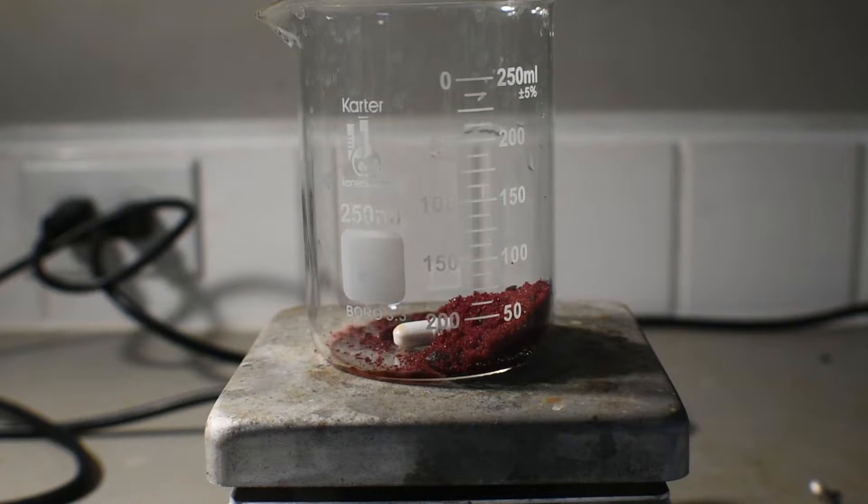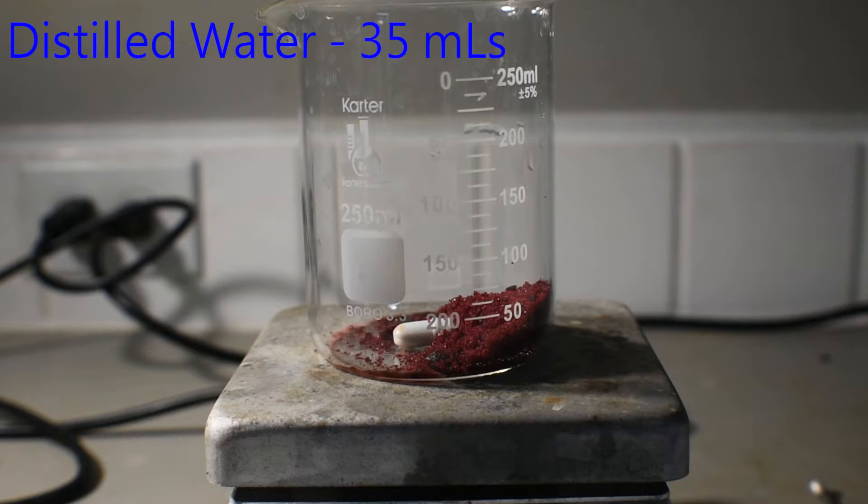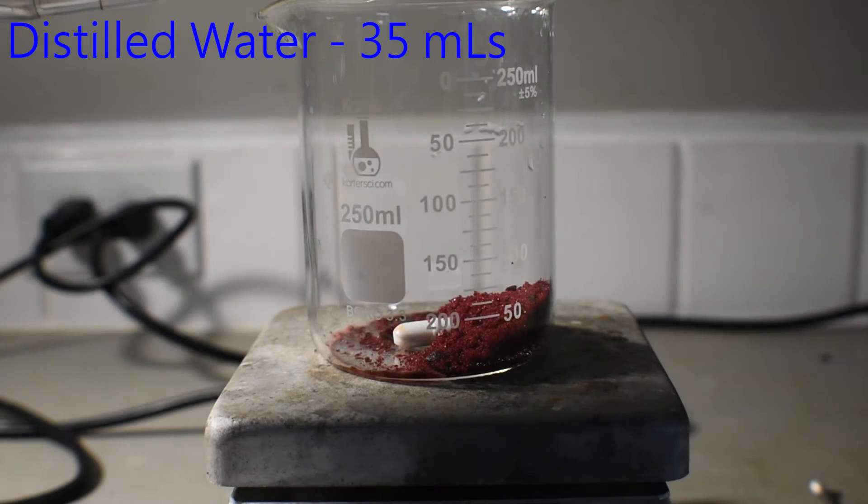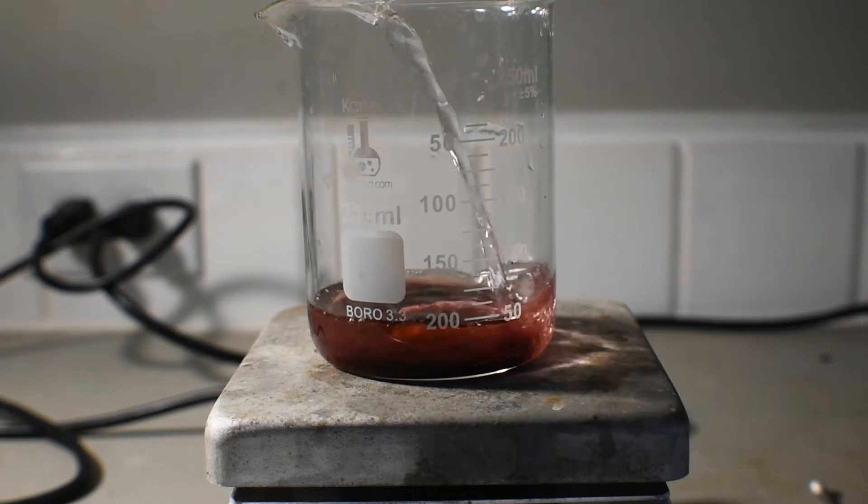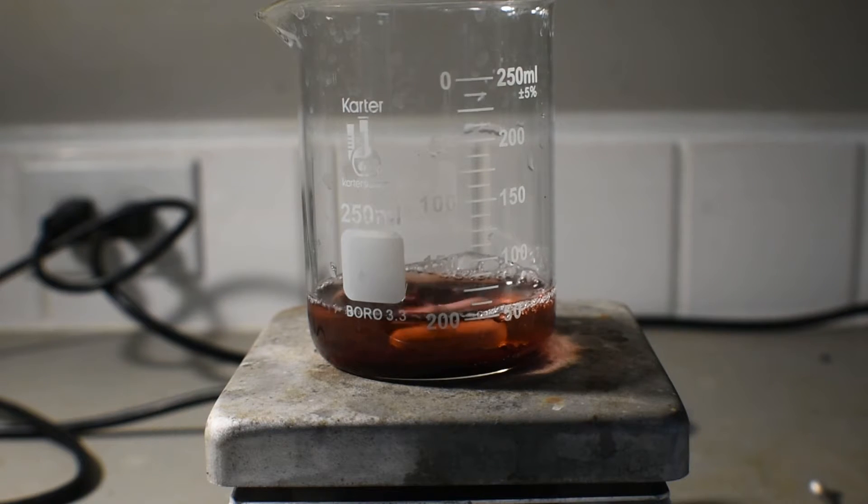This is then followed by 35 milliliters of room temperature distilled water. The cobalt salt will dissolve shortly with stirring.